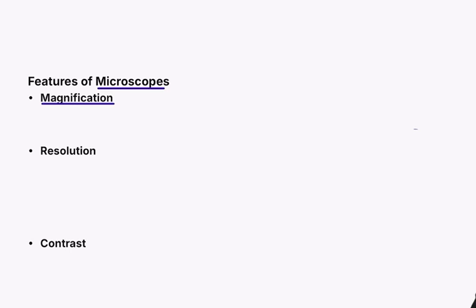You can compare it actually to a camera. Like in a camera, you have lens systems with which you can zoom in 2x, 10x, and so on. Similarly, in microscopes, you have lenses with which you can magnify, and that is how we can see the different bacteria, viruses, kidney biopsies, and so on.